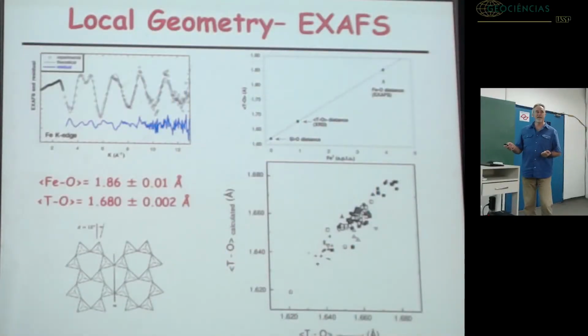What do we expect for the silicon-oxygen distance? If we do an average on a few thousand structures where silicon is tetrahedrally coordinated, we have an average of 1.62 angstrom for all the silicates. So that's a distance we expect, being it a silicate with silicon in tetrahedral coordination.